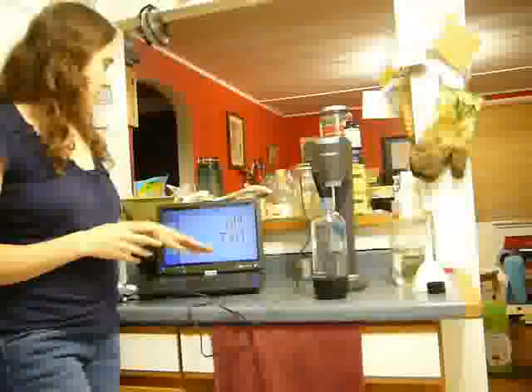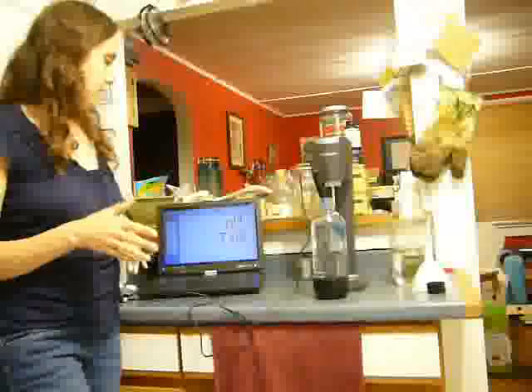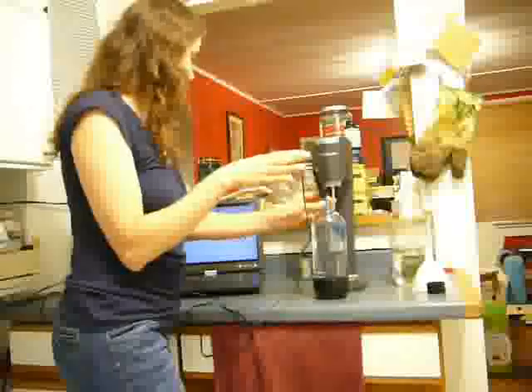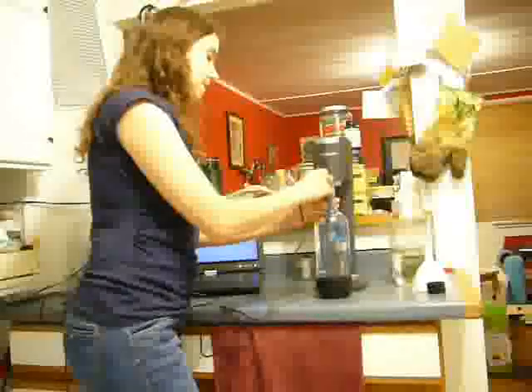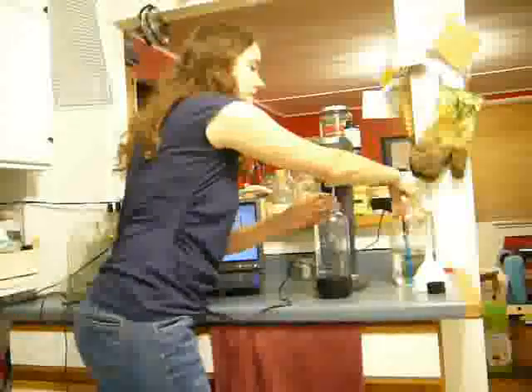Now, we're seeing right here, we're running a little bit around 7, so I'm going to say that our pH is roughly around 7, a little bit over. So this is ever so slightly over or closer to basic.